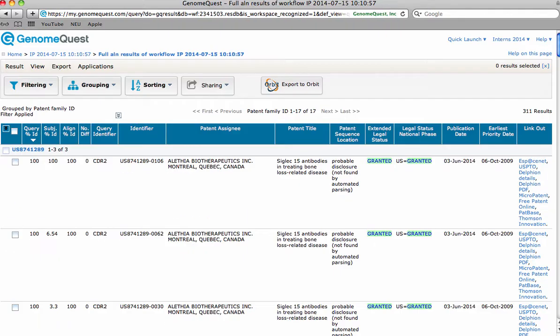Using the filter and grouping widgets to suit your needs will save an incredible amount of time and resources. Try them today.